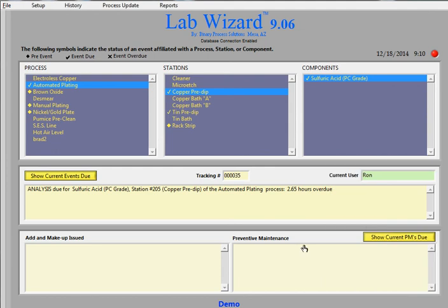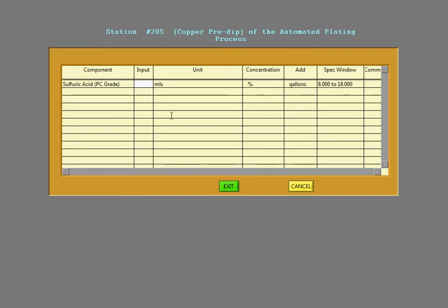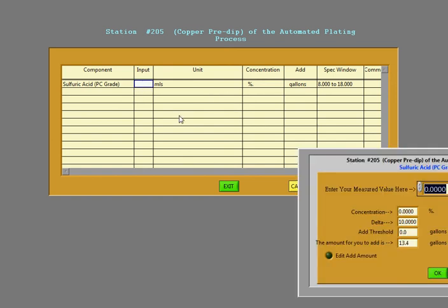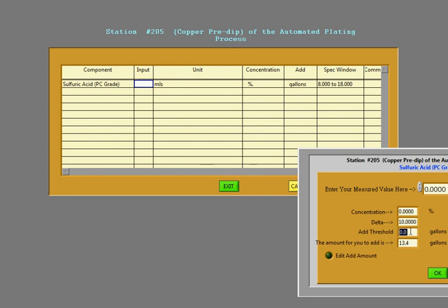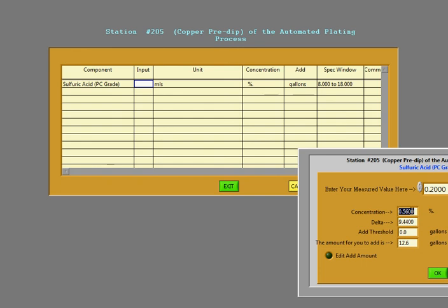So we're going to input the number of mils, titration. And in this case, this component analysis has been set up with a concentration field, a delta, an add threshold, and the amount that you add. So if we were to put in 0.2 right here, then the concentration is showing up as 0.56. The delta is 9.4. So we'd have to put 12 gallons of chemical in for this. So this is kind of an example of what happens when the technician clicks on an event.